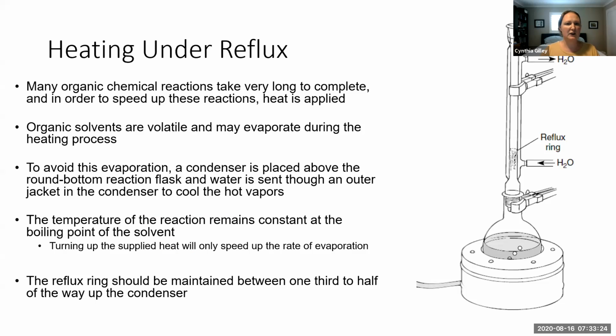So one thing you're going to note when you look at the activity is that this particular reaction has to be heated under reflux. Which reactions have to be heated under reflux? Well, they are the reactions that take a long time to complete. In order to speed up the reaction, what we can do is give the reactants more energy by applying heat to the reaction, right? That gives more molecules enough energy to overcome the activation energy barrier of the rate determining step. So many reactions, particularly organic reactions, need to be heated.